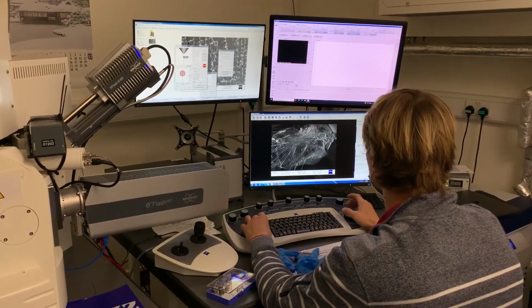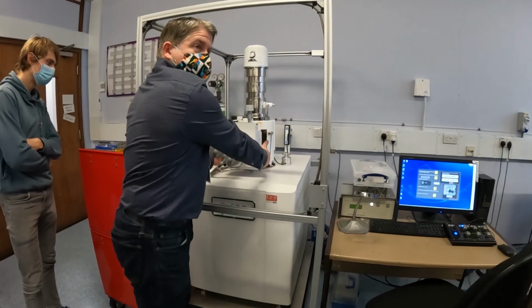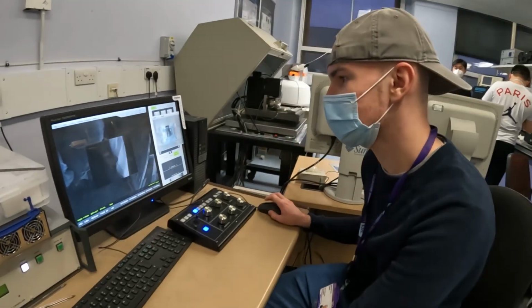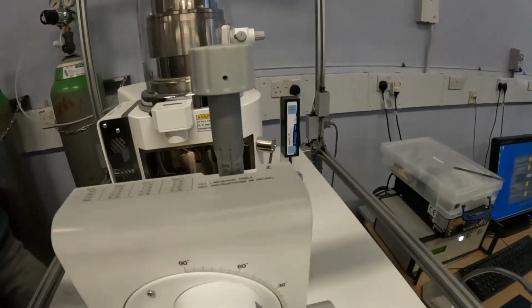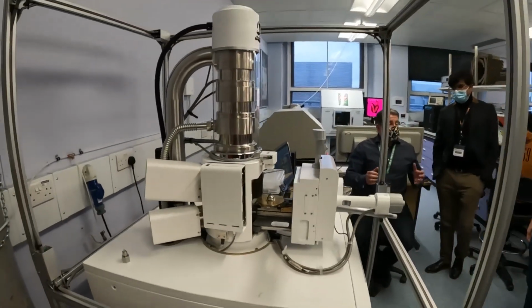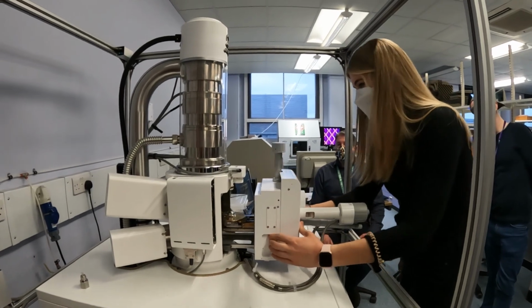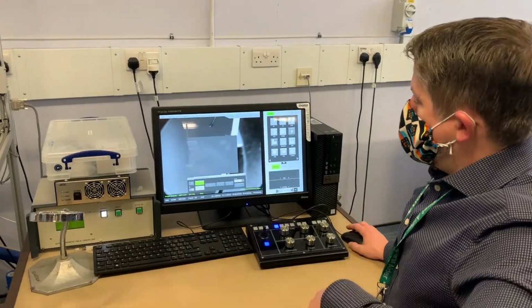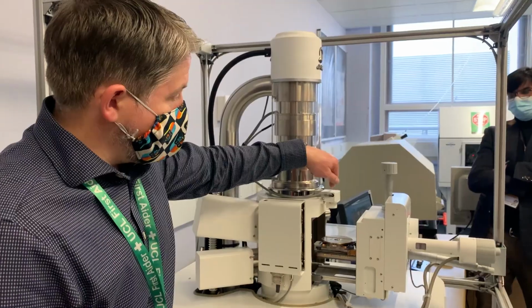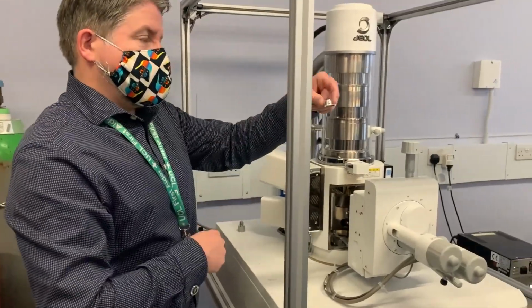Scientists can understand a lot about the materials they are studying with SEM. This has made it an indispensable tool for many fields of work, including commercial, scientific, industrial and medical. 3D images of specimens at high resolution, structure and chemical composition can all be seen. SEM has contributed enormously to research such as deepening scientists' knowledge in developing semiconductors and microchips due to its easy interpretation and resolution.